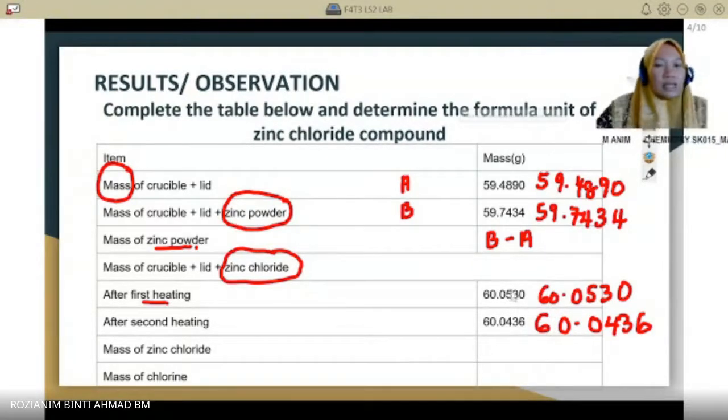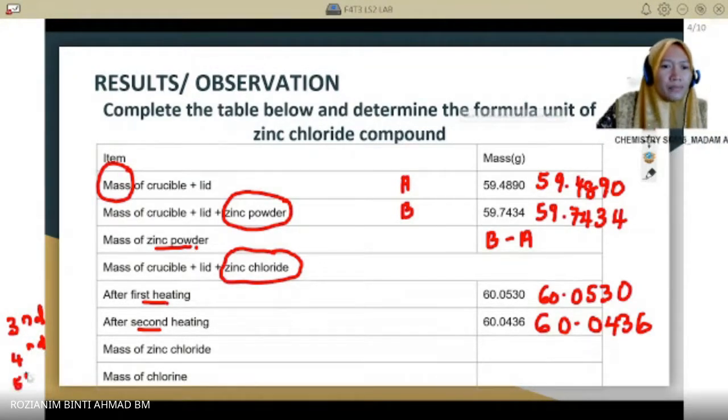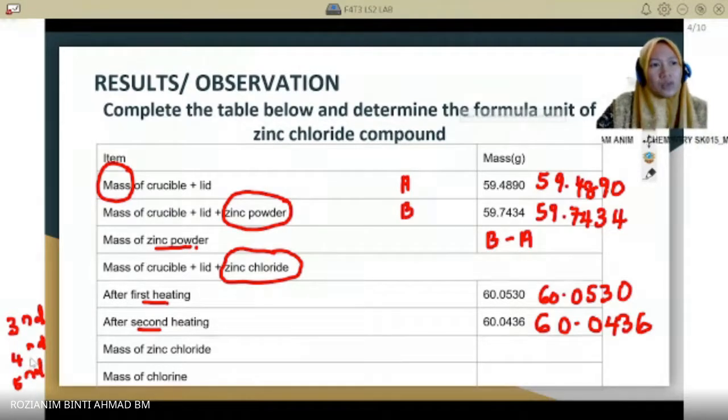So the question is why? The data I already gave you only considers 2 repetitions of the experiment. Why did I not give 3 data, a third reading, a fourth reading, and so on? It means the repetition must be repeated until we make sure the compound is totally dry. How do I know the compound is totally dry? How do I know? I can stop the experiment.